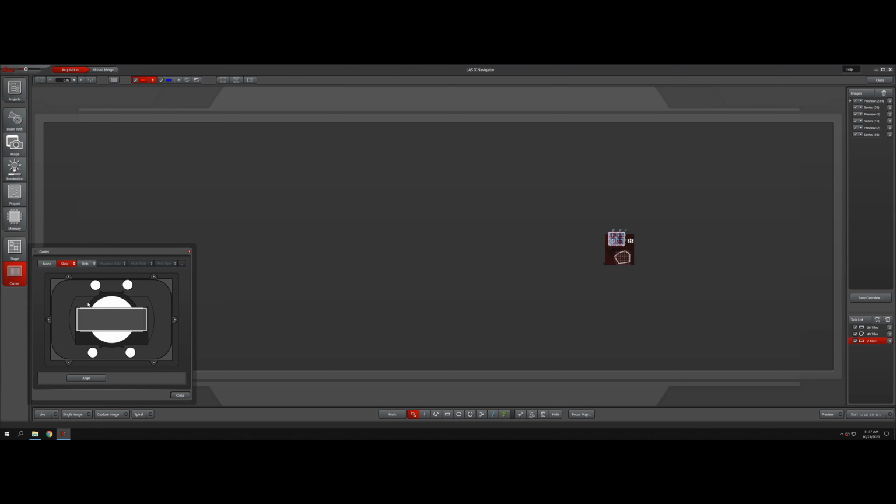But without this, I don't recommend using these pre-configured profiles with the adjustable universal holder, because you may run into the edges or bump the objective to the edges of the holder, so it is not recommended.